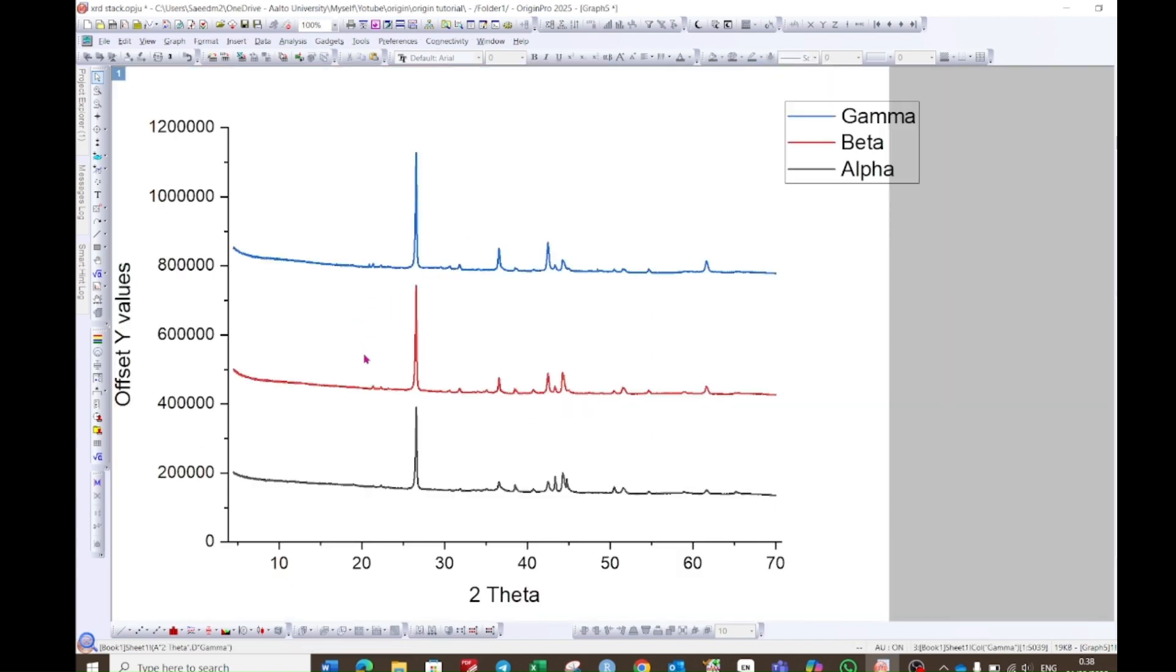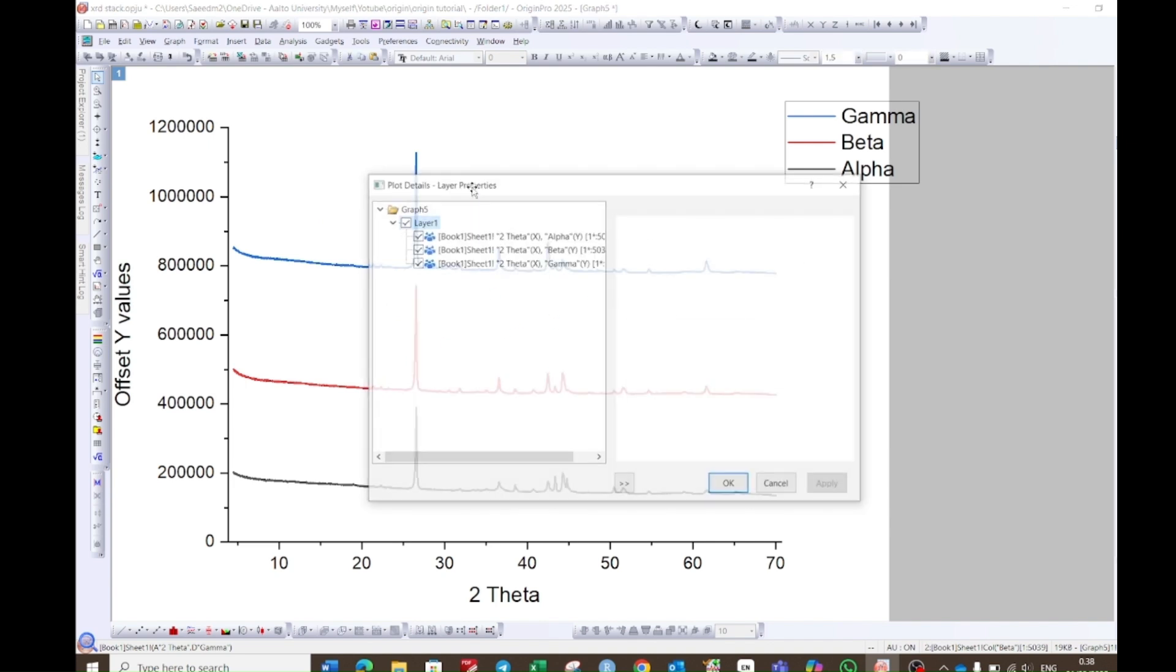Now you can increase the width. As you can see from here, if I have to move this graph I cannot move this. For example, if you want to move these graphs up or you want to have a different distance between the graphs, then you need to double-click on the graph.